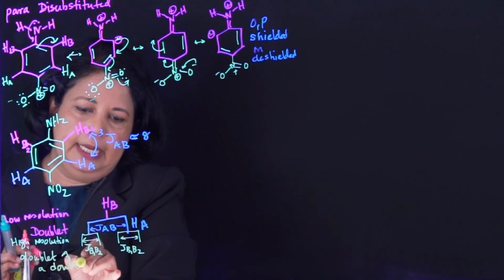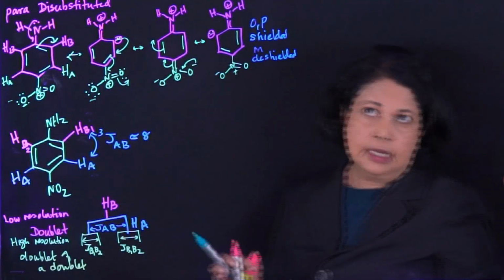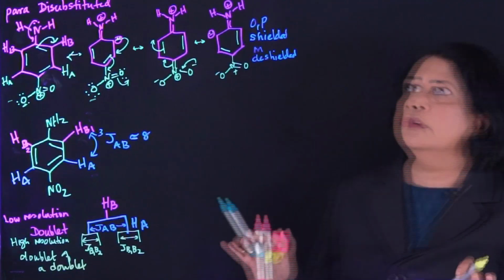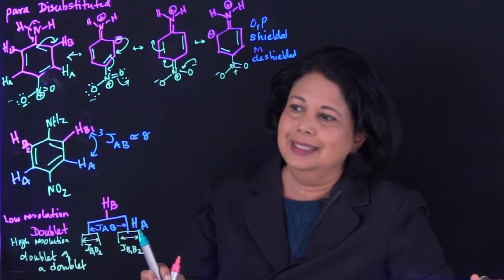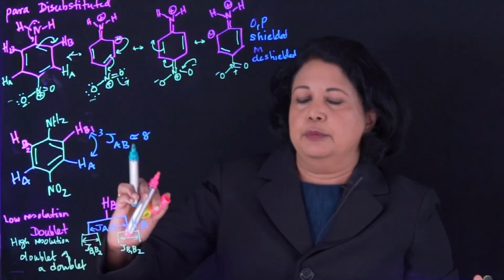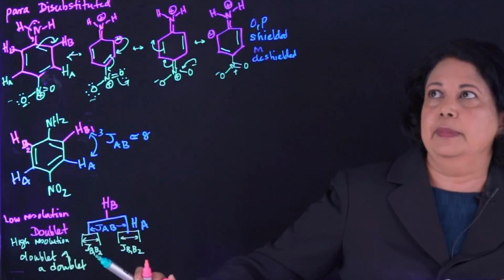Now if you go to the NIST webpage, nist.gov, and type in the name of a molecule, it would bring up a spectra, and you would see these values there. And they also have spectra for most molecules that you're familiar with.